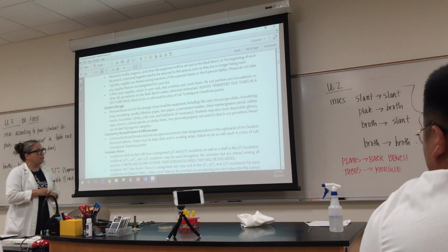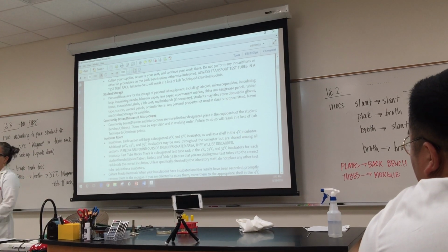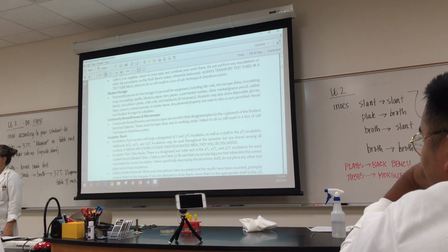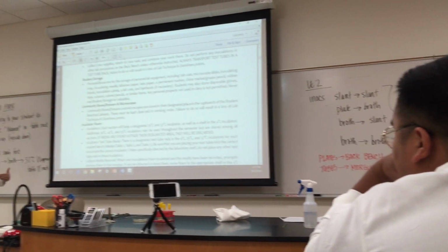All right. If you put things in the wrong place, make a mess, like you spill stain all over the inside of it, and you just go home and you don't say anything, and then tomorrow morning someone says, someone spilled stain all over the inside of my drawer, then you might lose some of those technique and cleanliness points that we talked about on Tuesday.